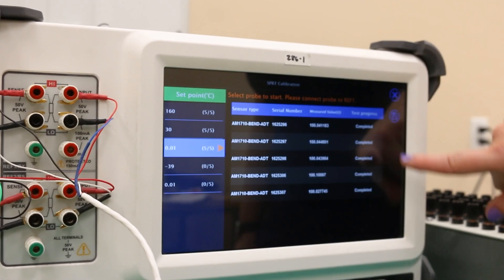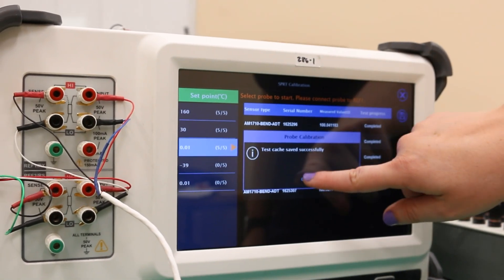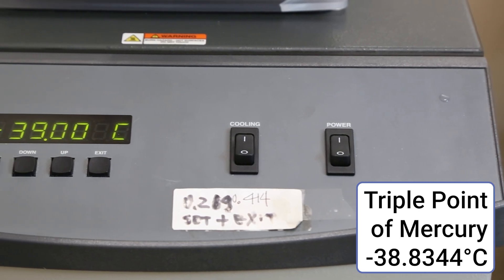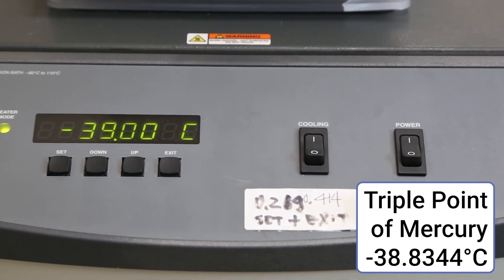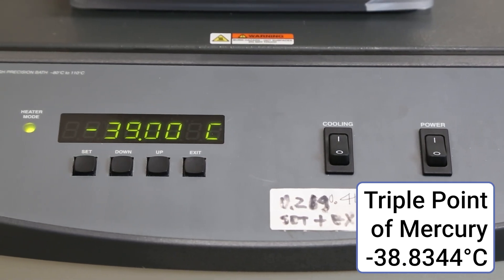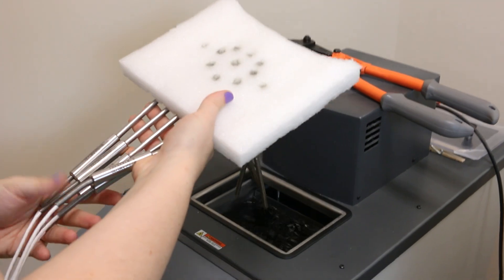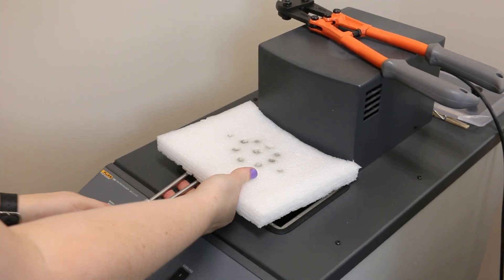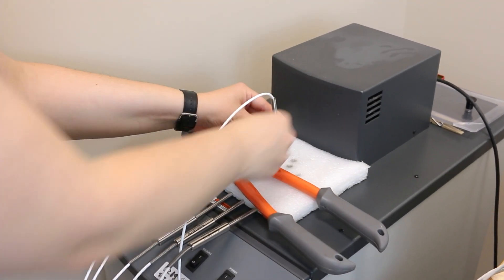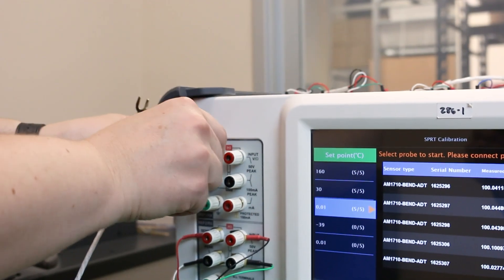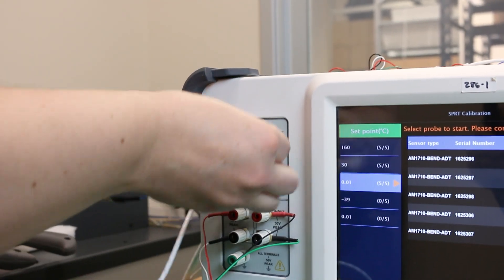After all probes have been measured at the triple point of water, we will move to the triple point of mercury. Instead of a mercury cell, we will use a comparison calibration at negative 39 degrees Celsius. This calibration point will be measured in the same way as the 30 and 160 degree points. Insert all five DUTs and reference probe into the bath and connect them to the five ports on top and REF1 respectively.